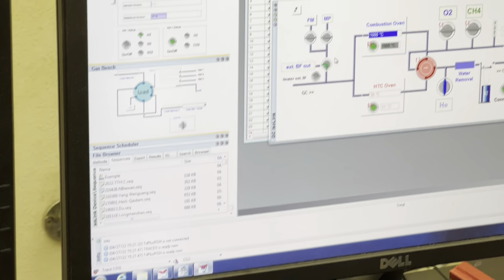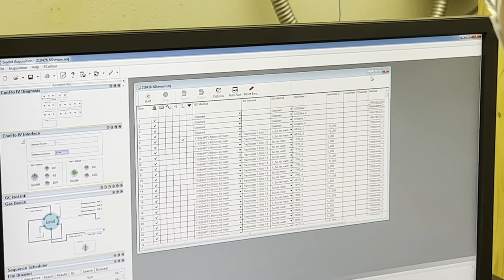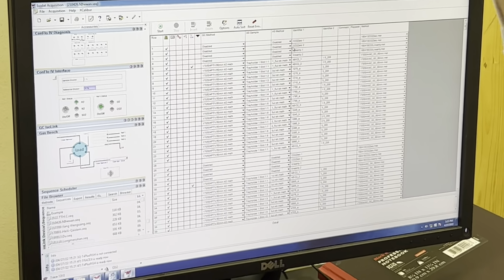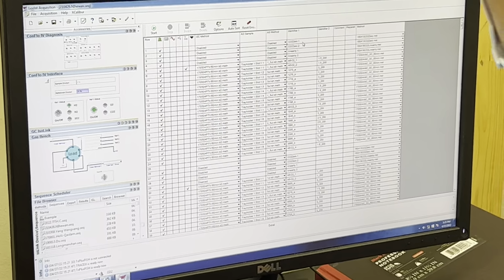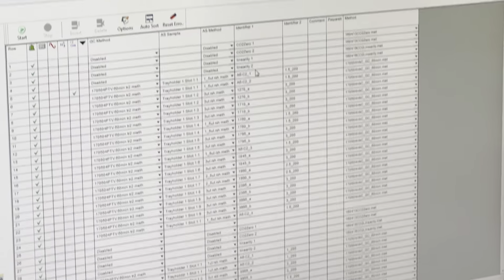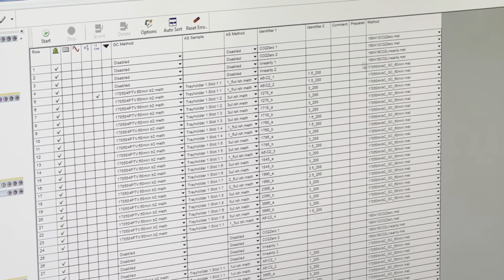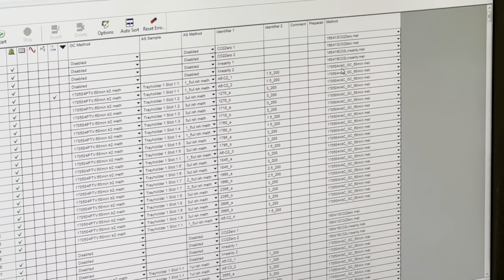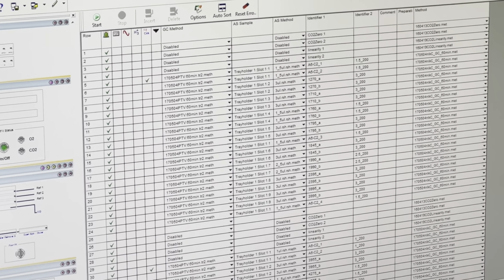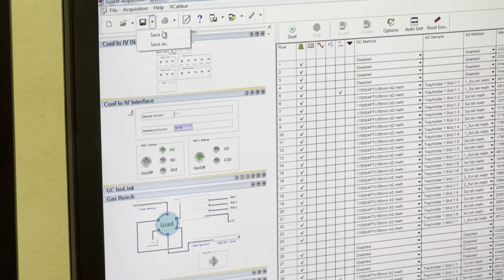I don't know, let's see this one. Let's run this one. We need to do a CO2, right? Yeah, I do zeros, I do a bunch, if you have a file that has a bunch of them. If not, we can just make one. It's NLK carbon GC, we can use this one. Maybe with a new sequence.